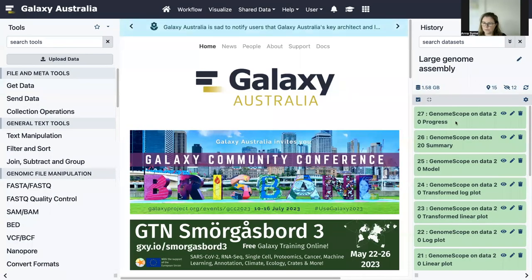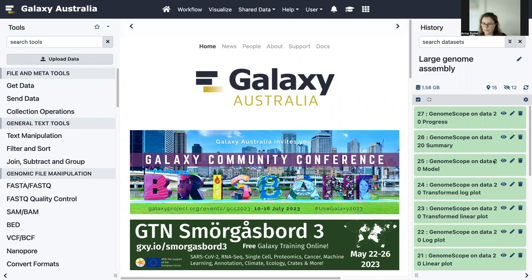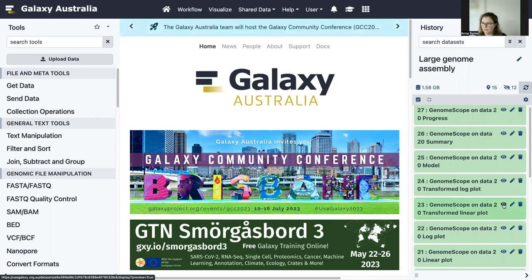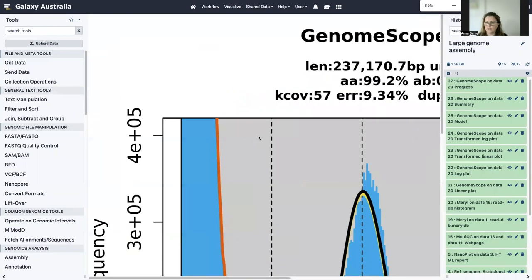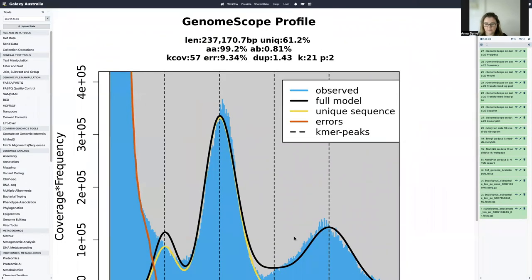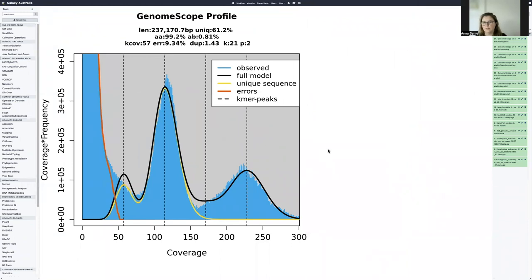We have our results now. One of the things we'll look at is the GenomeScope transformed linear plot — click on the eye icon. This is a graph of the results of our k-mer counting, and it will tell us some of the estimates it's made about the genome size and the ploidy. This is discussed more in the tutorial document, but this is quite a useful graph as a result from our k-mer counting.